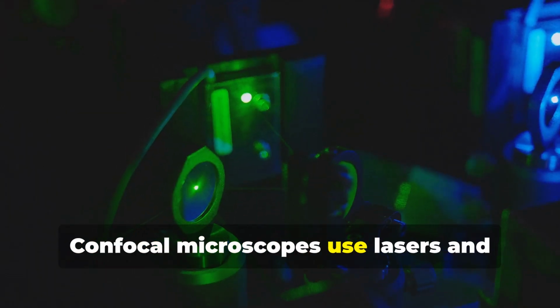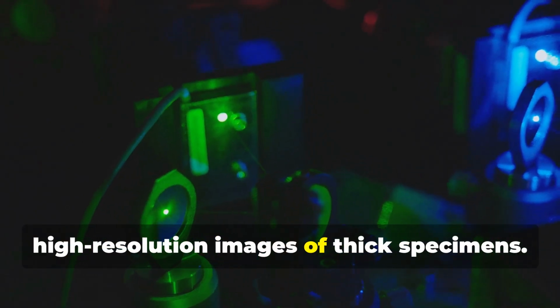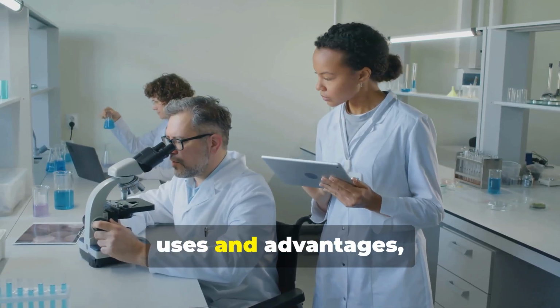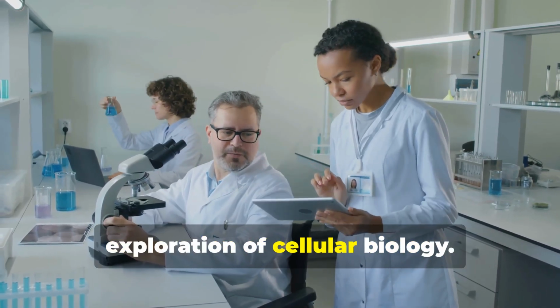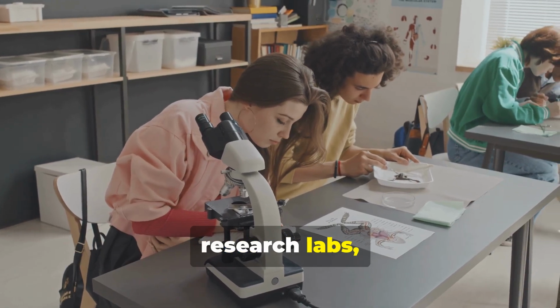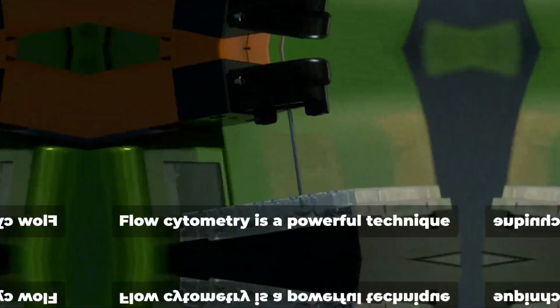Confocal microscopes use lasers and fluorescence to create sharp, high-resolution images of thick specimens. Each type of microscope has its specific uses and advantages, making them invaluable tools in the exploration of cellular biology. From basic classroom settings to advanced research labs, microscopes continue to unveil the hidden secrets of life.